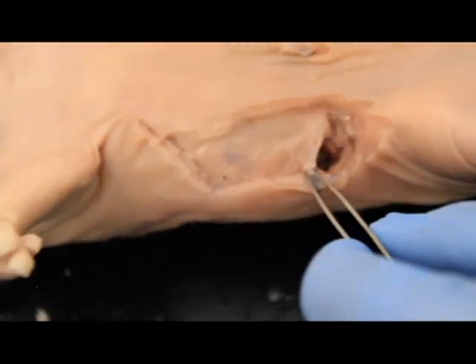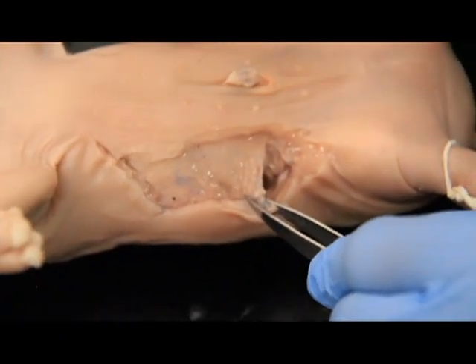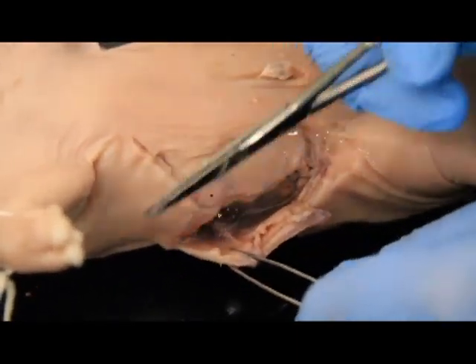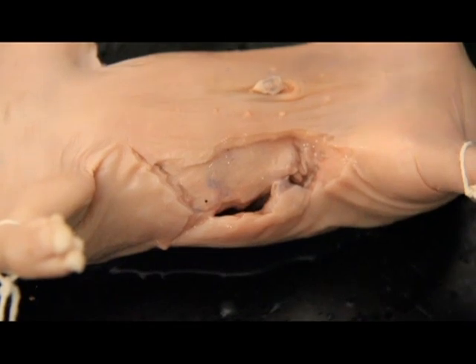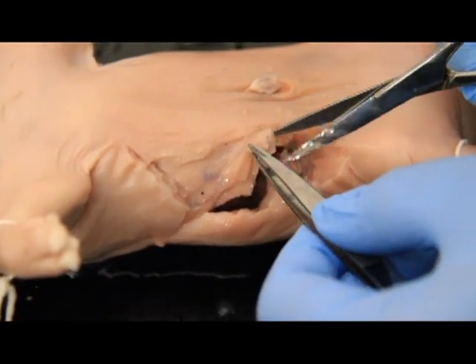And he's not really attached to anything, meaning that skin is not attached to any of those major organs. So we can actually make large incisions without harming anything. Now, if your pig has more juices on the inside like this one does, that's okay. You can go ahead and squeeze him out and take him back over to the pig juice bucket and dump out those juices. Remember, those juices never ever go down the sink.